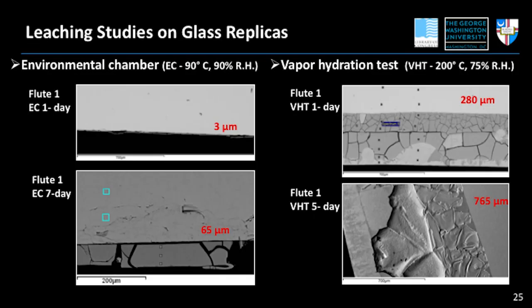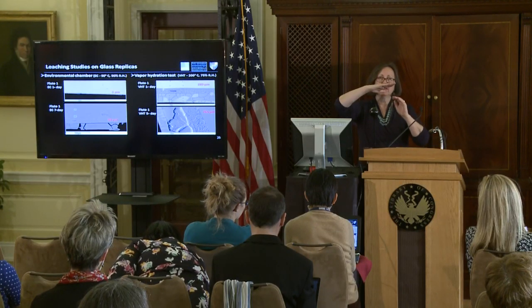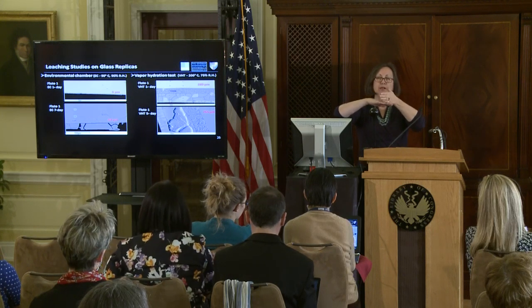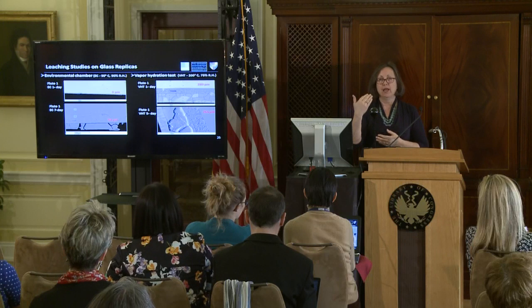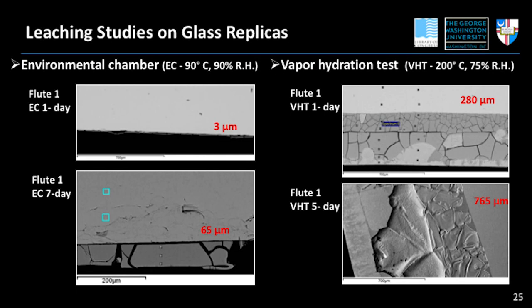And this is the result of our little games in the lab. So what you are looking at here is a scanning electron microscope image of each of those little coupons, now mounted in cross section, and then we polish it until we expose the surface and we can see what has been happening to the glass in cross section. So the black part of each image here is where the exposure to the air and the humidity takes place. It's actually mounted in epoxy, so it gives a black image in here.